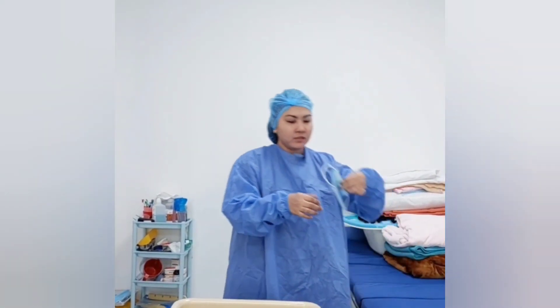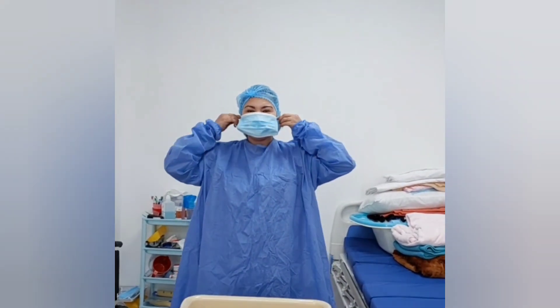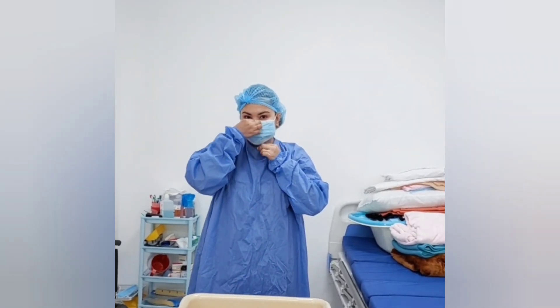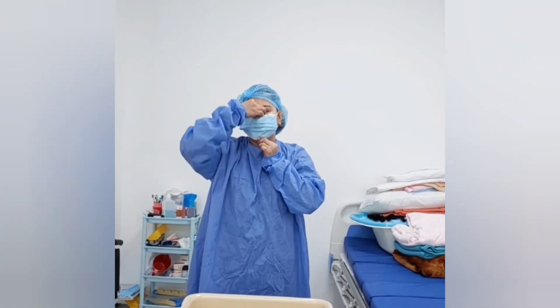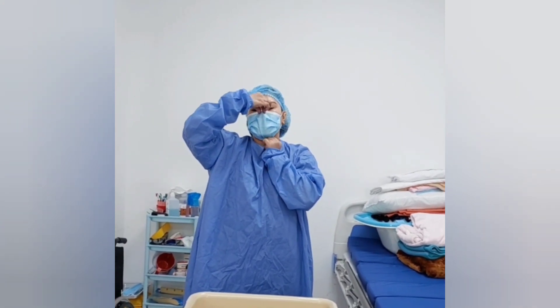Now, I will wear the mask. Pinch here at the nose bridge and pull over downward under the chin.